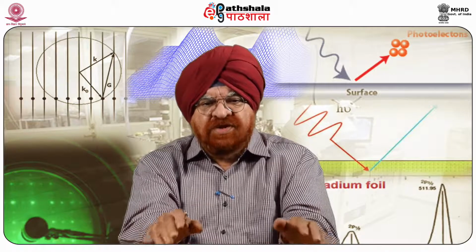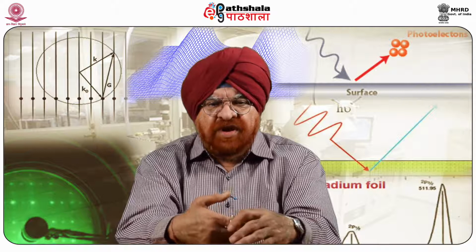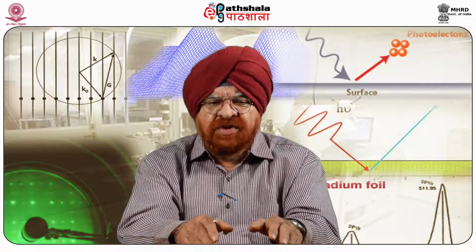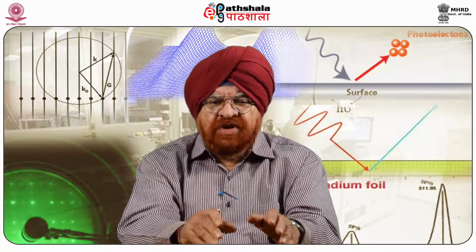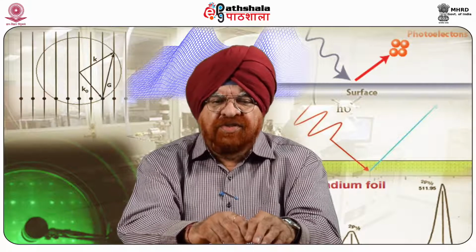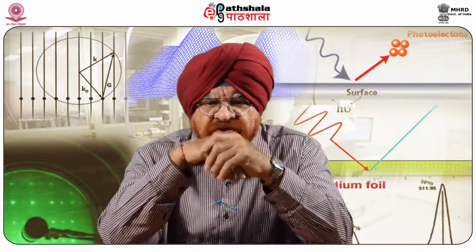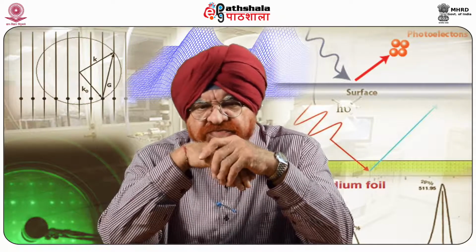Compared with the transmission electron microscope, three-dimensional AFM images are obtained without expensive sample preparation and yield far more complete information than the two-dimensional profiles available with cross-sectional samples.